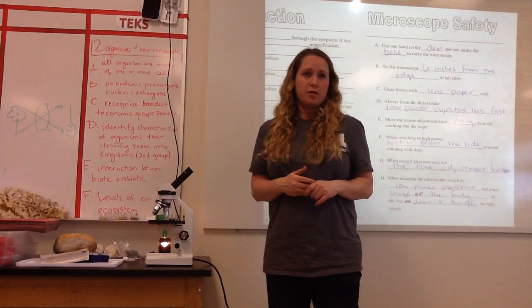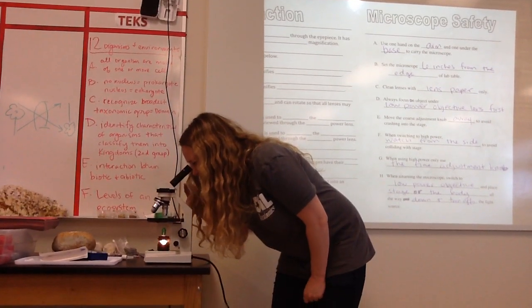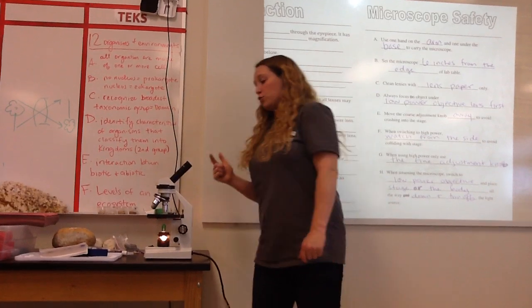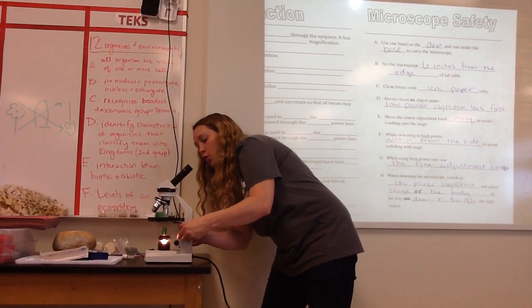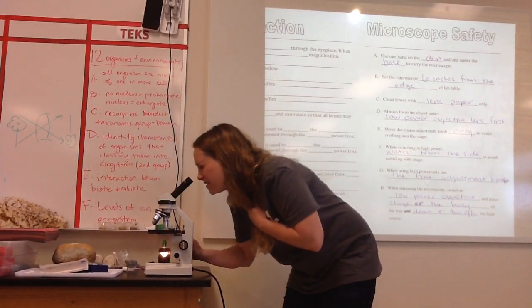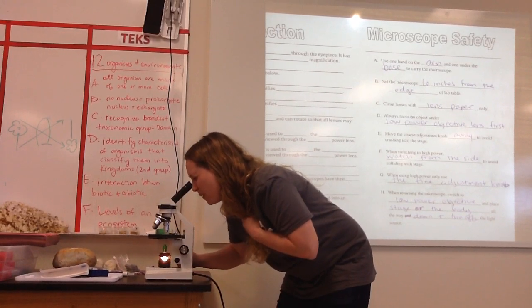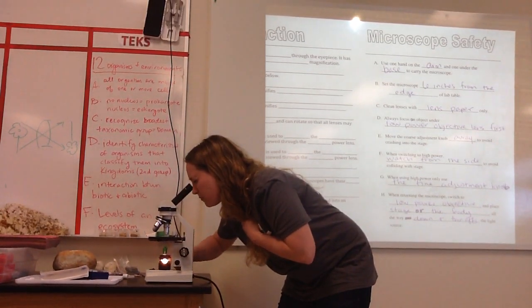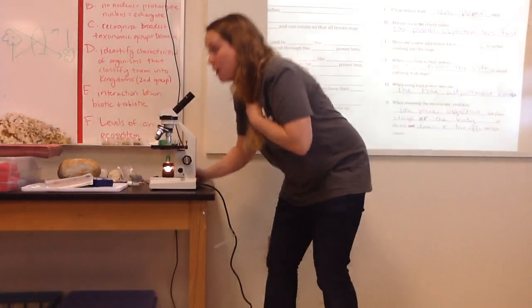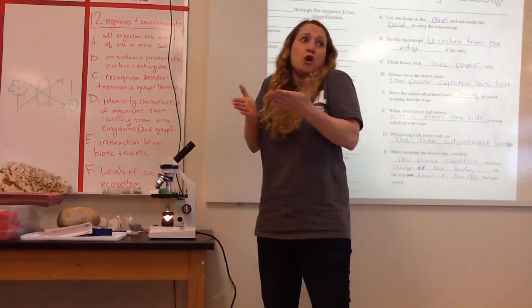I can take observations. However, what if I backed up and I never could find it? Then I'll need to take my eye away, look from the side, and move the stage all the way up again. Okay, now it's up all the way. Now I can put my eye back on and start backing up again until I see it. Oh, there it is again. Let's try the fine knob and see if I can make it any better in focus. Looks great. I'm going to take my observations. Does that make sense?